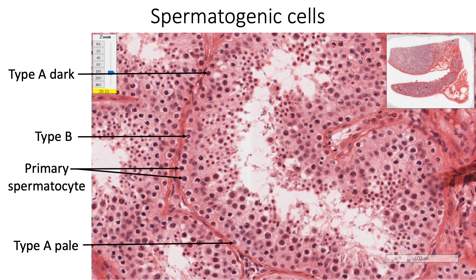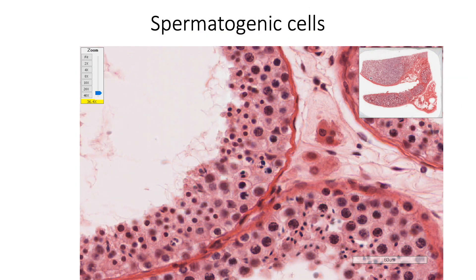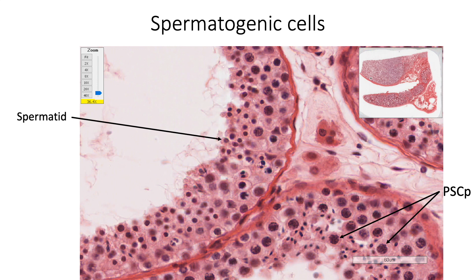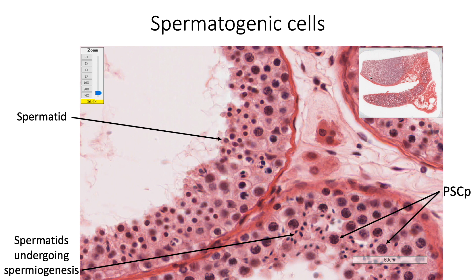Primary spermatocytes are large cells with round nuclei containing condensed chromatin. Pachytene-stage primary spermatocytes and beyond are found in the adluminal compartment and show condensed chromatids. These complete the first meiotic division to form secondary spermatocytes, which rapidly complete their second meiotic division and are therefore difficult to find. They form spermatids found at the luminal surface, which undergo spermiogenesis — including DNA compaction, acrosome formation, cytoplasm reduction, and flagella formation — to produce spermatozoa. As the seminiferous epithelium in adults is a site of intense cell division, different phases such as anaphase and telophase can be seen in sections.